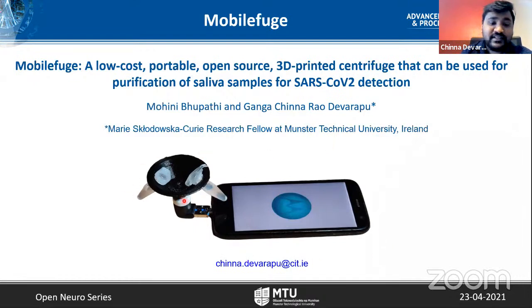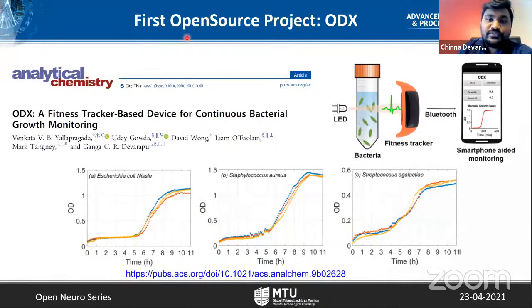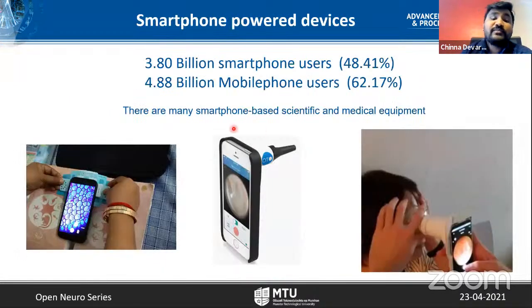This is the picture that represents the work which I'm going to present today. It's a centrifuge that you can plug into the smartphone, not quite literally, but I'll come back to that. My first foray into open source projects is through ODX project. Maybe some of you are familiar with this, where we hacked a fitness tracker to monitor the bacterial growth. And we try to monitor many bacteria like E. coli and Streptococcus. After doing this project, I was very motivated to try building many other biology tools, particularly based on smartphone.